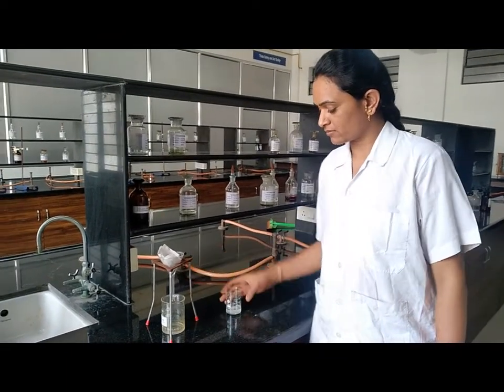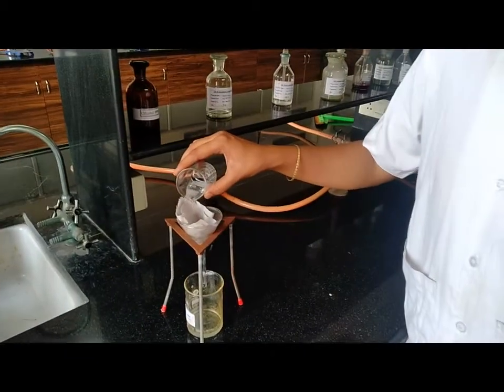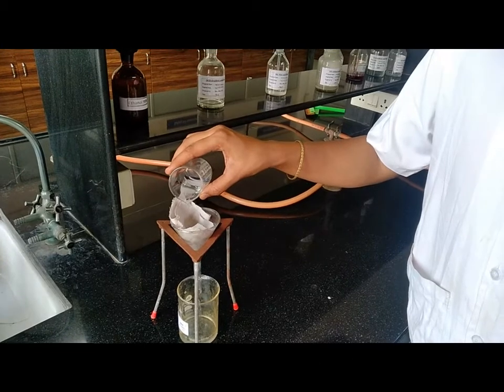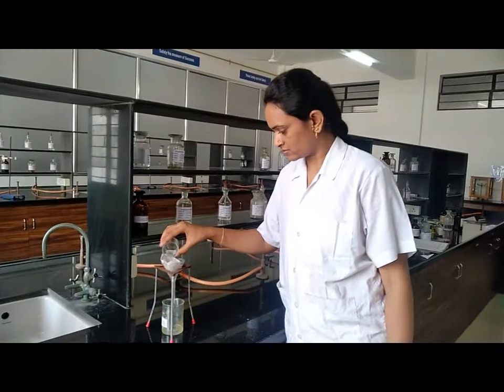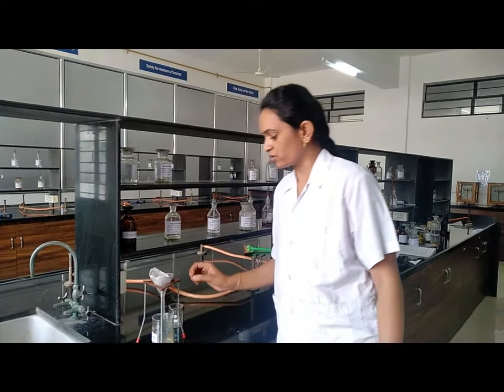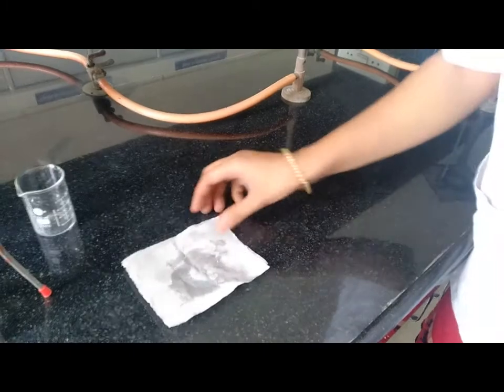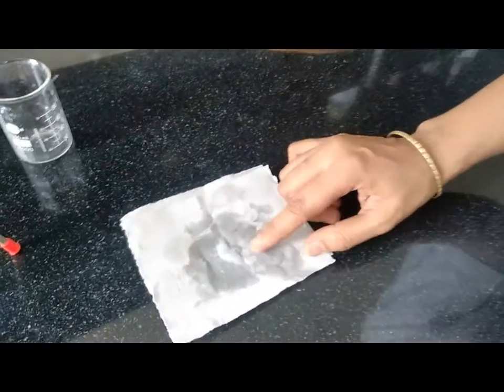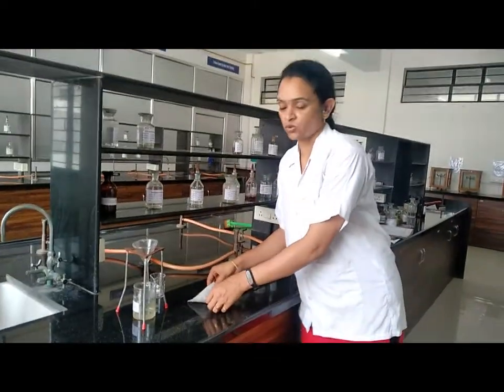Now for filtration we have to assemble the assembly and pour the solution into the filter paper. After filtration we have to collect the solid sample. After filtration we got these white colored crystals, crystalline powder. Now collect this crystalline powder and add ferric chloride solution to it.